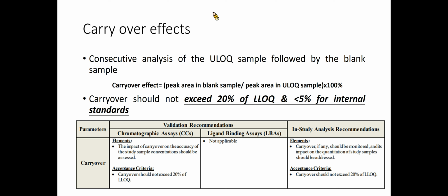Carryover between samples can occur in analytical methods. You should eliminate any carryover effects during method development. If carryover cannot be eliminated, you should assess the impact of any carryover during method validation on the accuracy of the study sample concentrations.